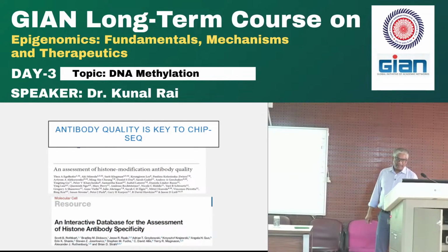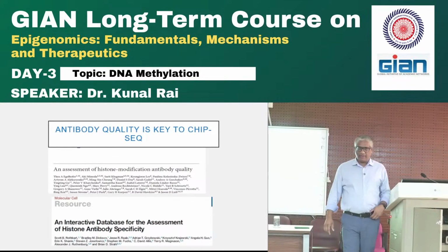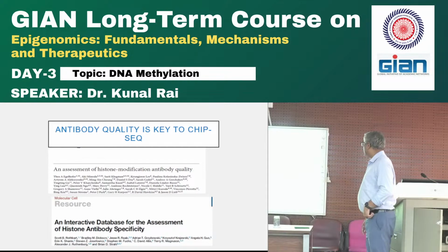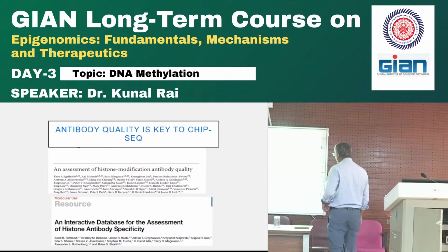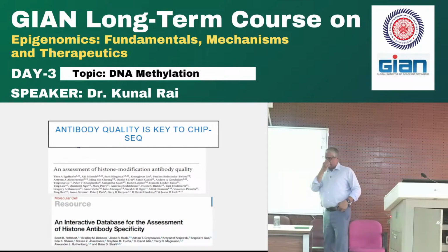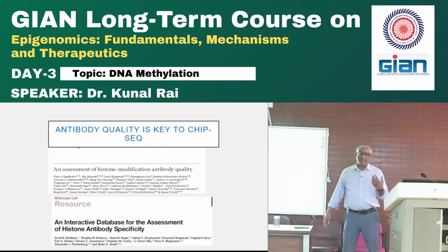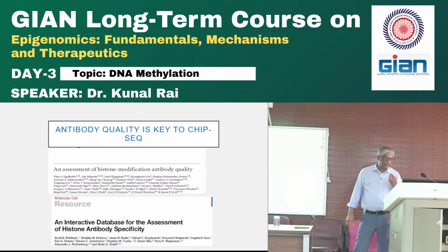Get it? She was on the right side. I was telling her to explain the Western blot. This is a Western blot on the right side, right? So an antibody gives you my beautiful one band here for Syn3B protein. So I know where my antibody is, right, where my protein is. But my second antibody might not be so specific, might pull down other stuff, right? So this antibody sucks on the right side. I can never use it. But the antibody on the left side is a good antibody. I could use it, right?